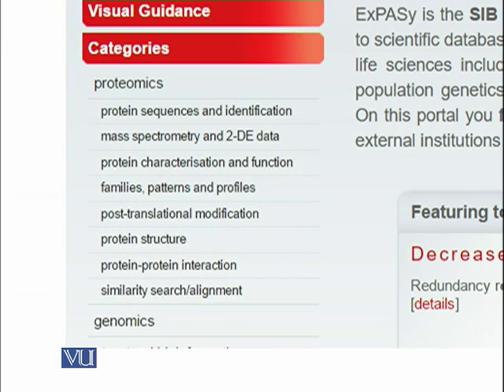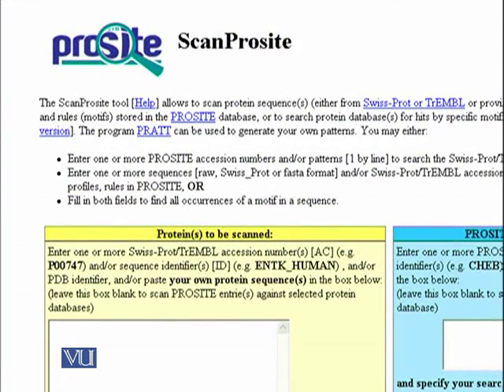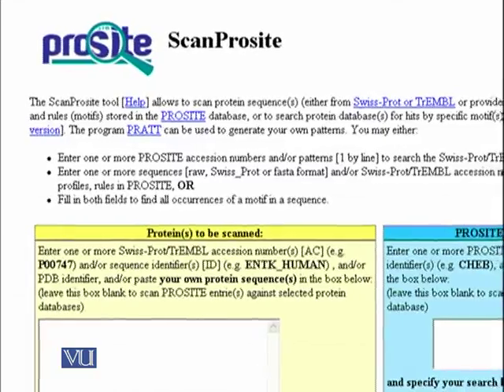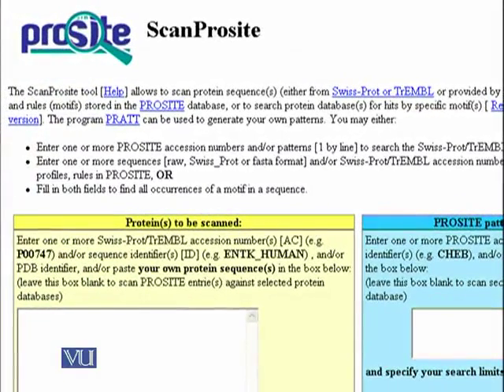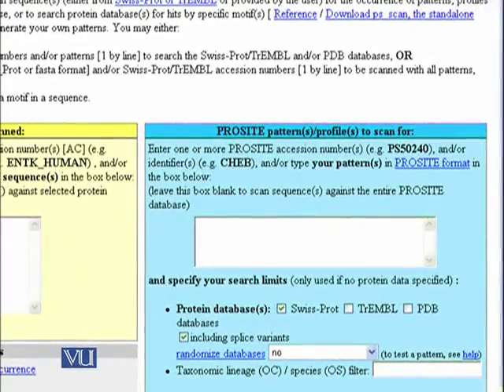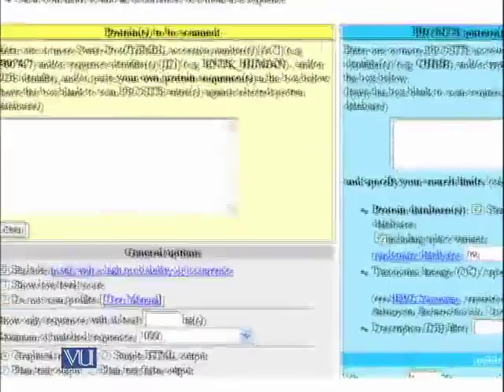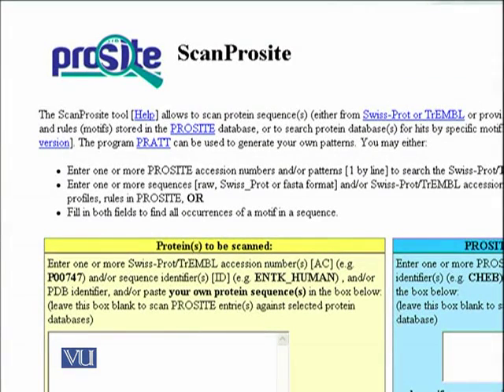I will not go into the detail of all the categories, but you can explore the ExPASy portal, and there is a high chance that the software or database that you need will be available there. Now I will give you an overview of a couple of software that are very useful on ExPASy. For instance, the ScanProSite tool allows you to scan protein sequences that you input and then search them in the ProSite database. You can input your sequence and it will extract the ProSite pattern for you when you submit the job. This is a very useful tool — it can help you extract all such patterns from the protein sequences.